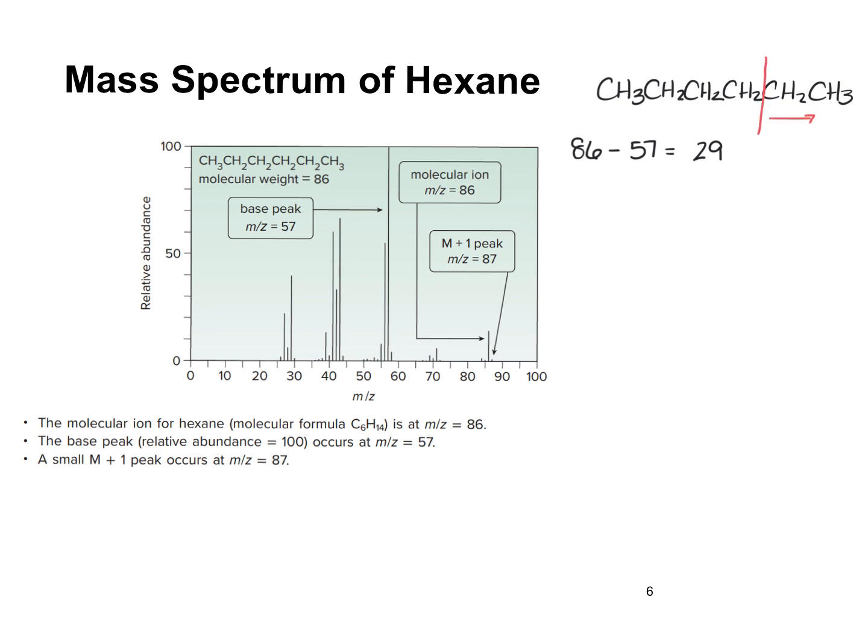And so this corresponds to that 29 molecular weight that's lost, or that's broken off. It's not really lost, it's just broken. Okay, and then the 57 that you're detecting here is this molecule. And so it's CH3, CH2, CH2, CH2, and a positive. Okay, and that's a cation, that's why we can detect it.